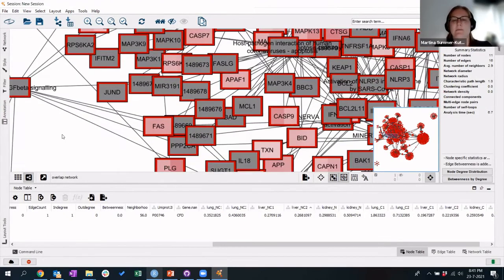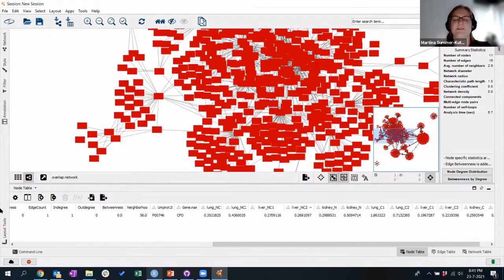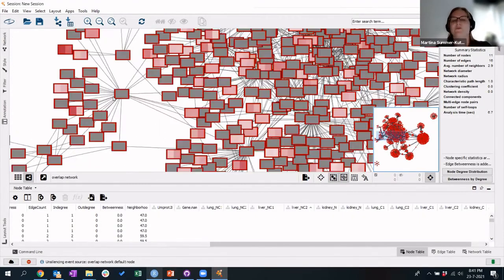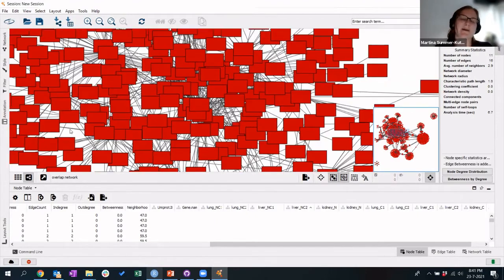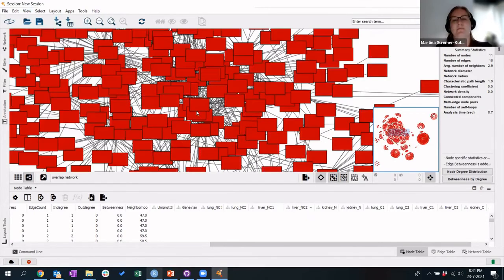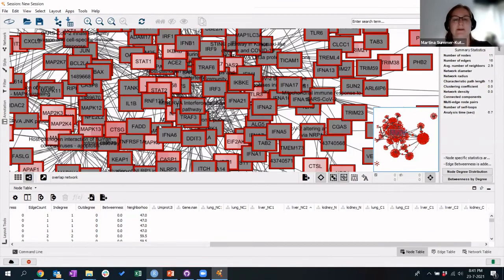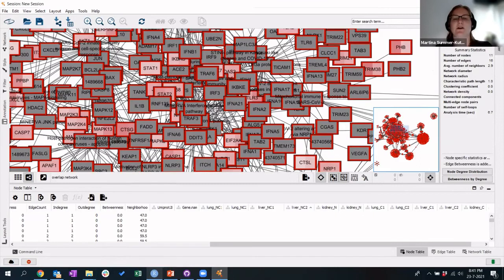And much better it would even be if you remove all the gray ones. Everything that's not abundant in any of them, you could remove them and see, okay, for the ones that I do see and that were measured, what changes do I see? And then you could look at this from an overall perspective, basically, because there's a lot of gray here, a lot of proteins that were not measured, which is typical for proteomics data, right? We're not able to measure genome-wide yet.